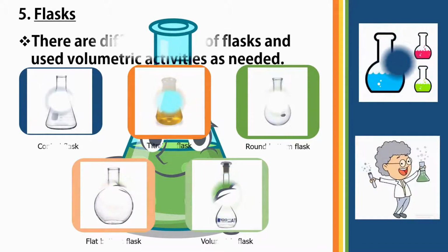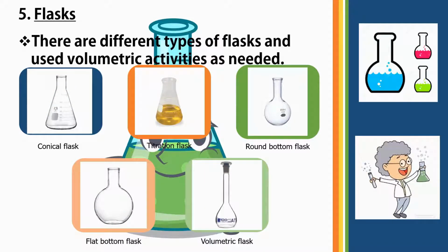Flasks. There are different types of flasks, used for volumetric activities as needed. Conical flask, titration flask, round bottom flask, flat bottom flask, volumetric flask.